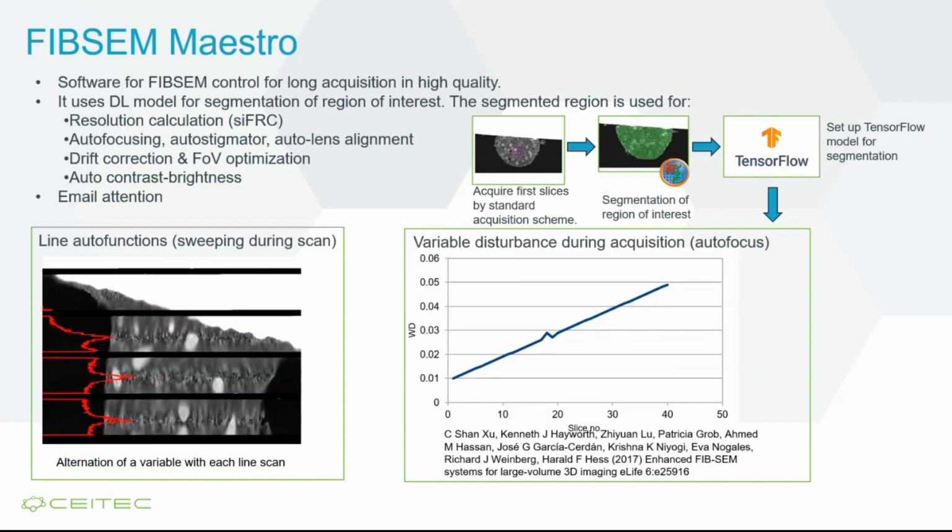Yes, and this auto function is particularly good for cryo, because the standard auto function works on a series of images in some defined area, and this is not perfect for cryo because of high dose, and you would probably barbecue the area.